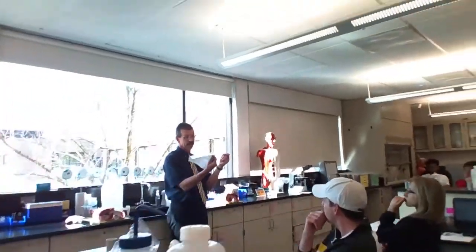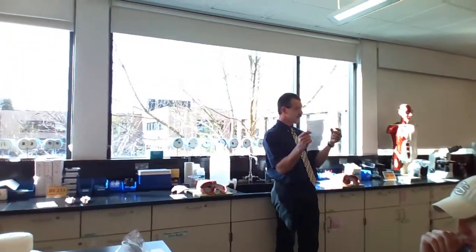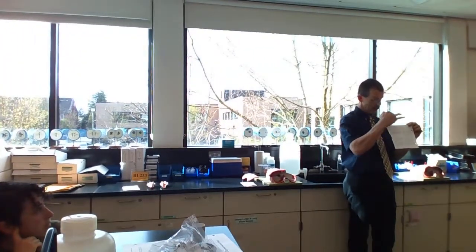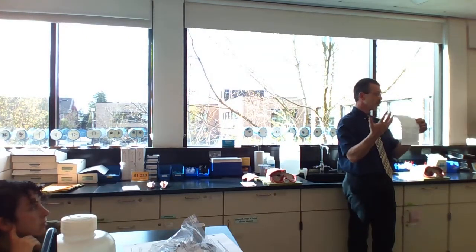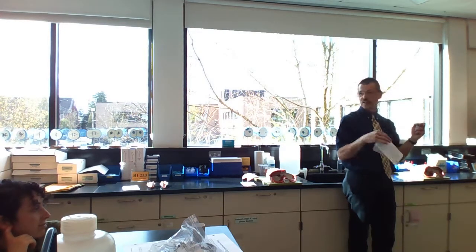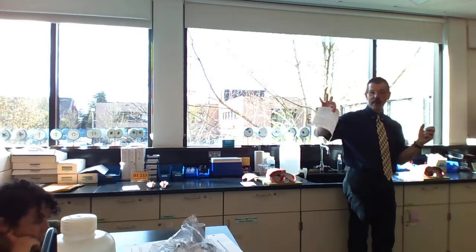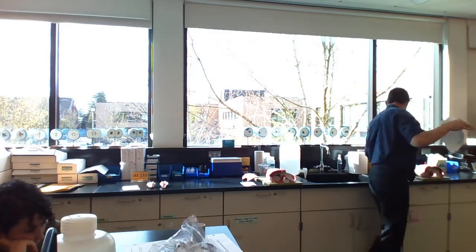Right? And we'll talk about it at the end of class about what those colors mean. But your goal basically for the lab is to figure out how to set up these 2, 4, 6, 7 tubes in your team so everyone knows what you're doing and works together, right? That's the hardest part, the communication concept. So the test tubes are over there, and then we have tape you can label with, whatever. That's your business. But I'm going to walk you through the next lab while you're thinking about that one.